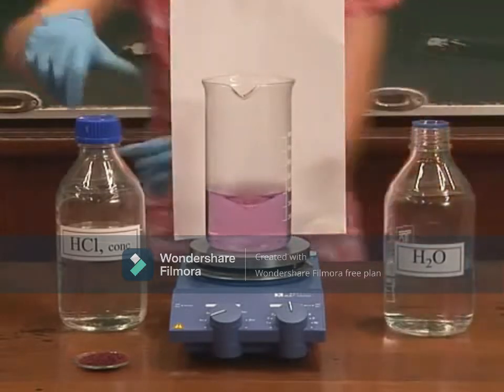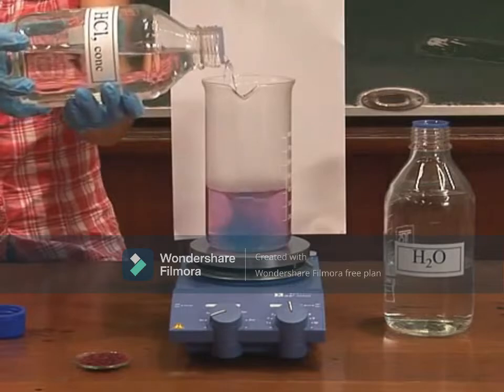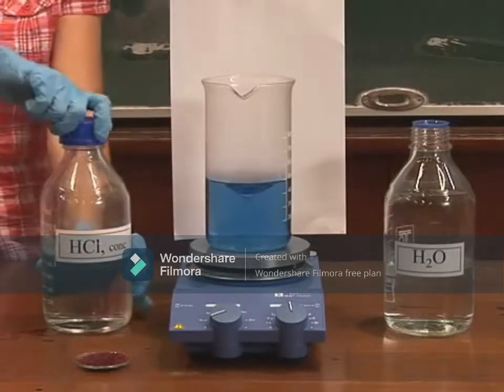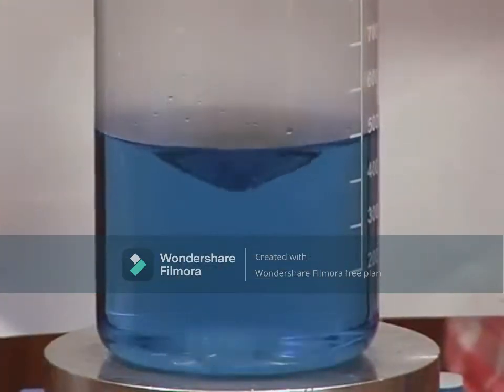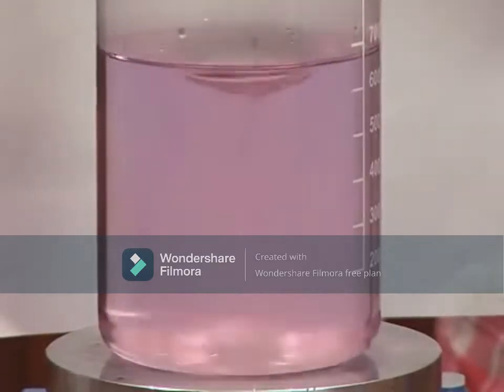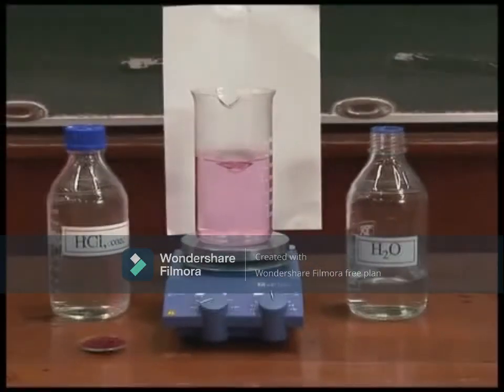In fact, cobalt chloride solution or cobalt chloride paper is used as an indicator to test for the presence of water. So the color can change from blue to pink and back to blue using water and acid. This is what we call chemical equilibrium.